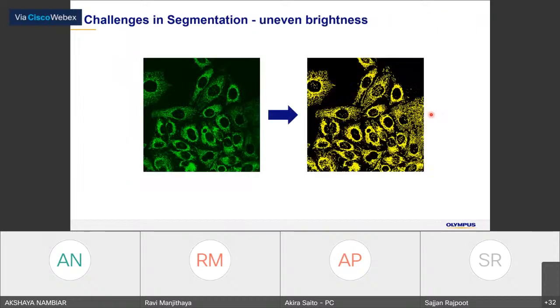for biologists. We can easily understand that this area has individual mitochondria, and also in the very bright area we can identify the single mitochondria very easily.